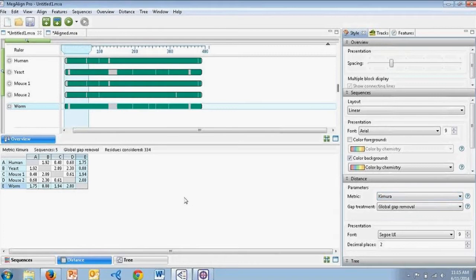Another option to point out is that the upper and lower triangles of the distance matrix are reflections of each other, so they will contain the same information, just something to keep in mind. And again, as I showed you, the values differ for each of the various metrics used. There are many useful resources located in the DNASTAR help for assistance interpreting the information for each specific metric that you choose. You can now access help for each application, either through the application itself or through our website. Just to mention, from the DNASTAR homepage, if you go under the Support tab, you can select Online Help and access it for any of these applications.